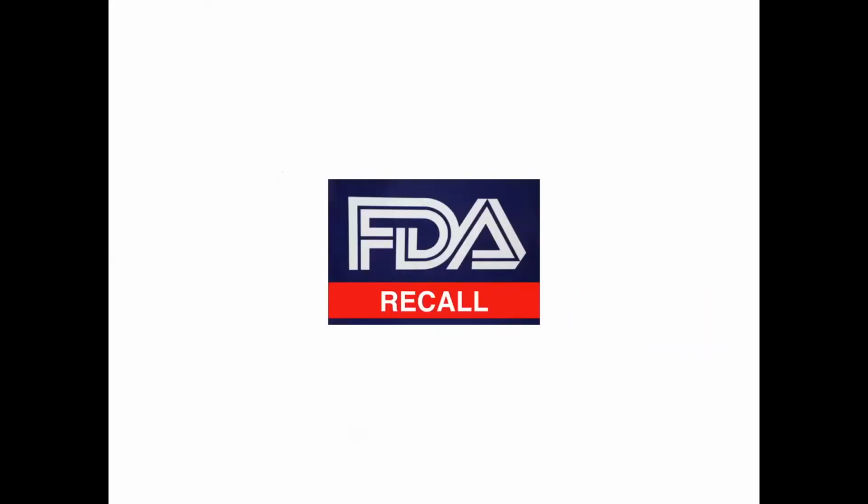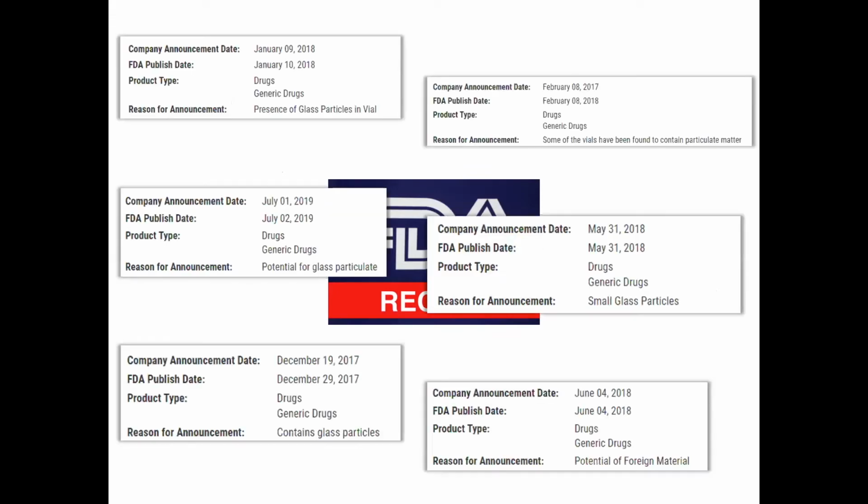One of the biggest things to avoid for a drug manufacturer is an FDA recall, which can happen for various reasons, but one of the most common ones is finding particles in the drug product. Here you can see a few examples where mainly glass particles were found in the product and caused the recall.